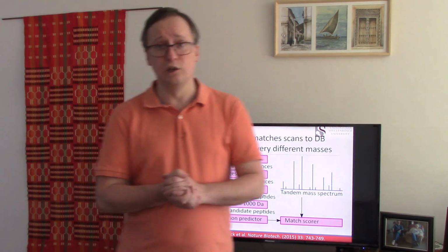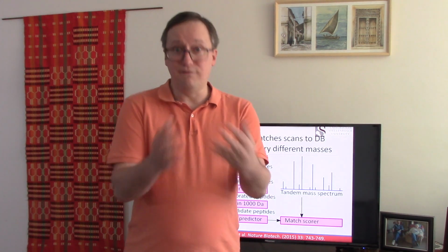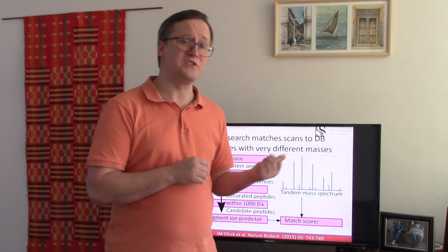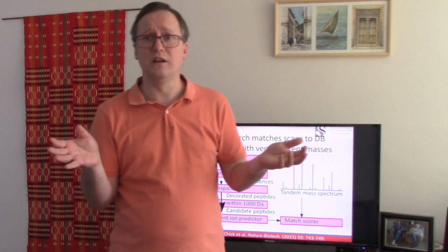You remember when we looked at database search as a PTM finder, we noted in advance which amino acids were going to be allowed to gain mass or not. And so we had to pre-specify all types of modifications that search would consider. With OpenSearch, we no longer have to do that.